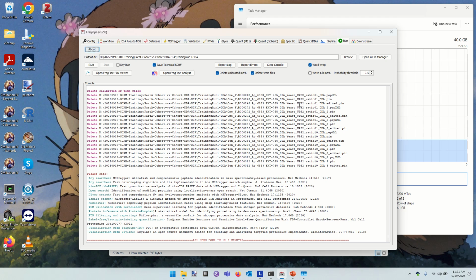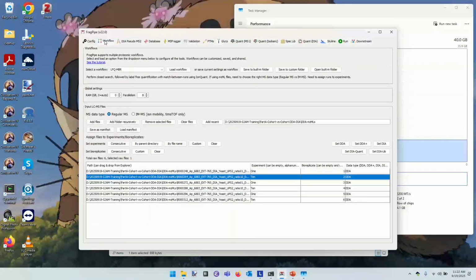That means that we can quantify it by multiple channels at once, rather than just relying on the peptide ion rising and falling. Now, the data that come from this are a lot more complex as a result. But helpfully, FragPipe is able to identify them pretty much as straightforwardly as we did this set.